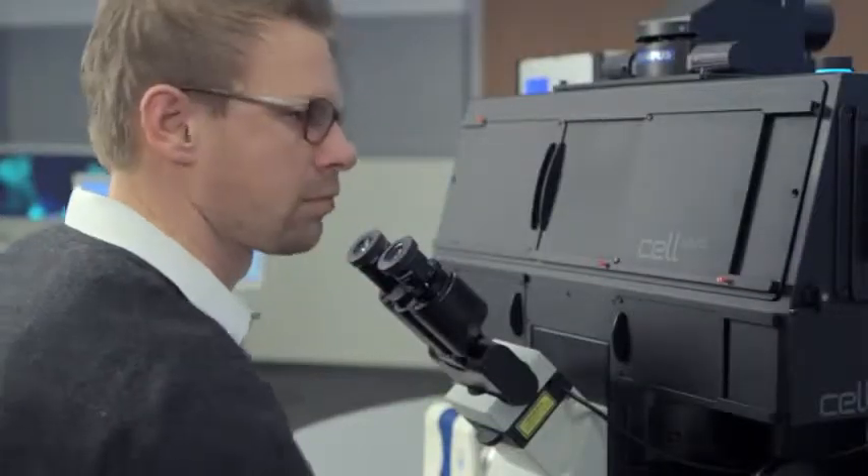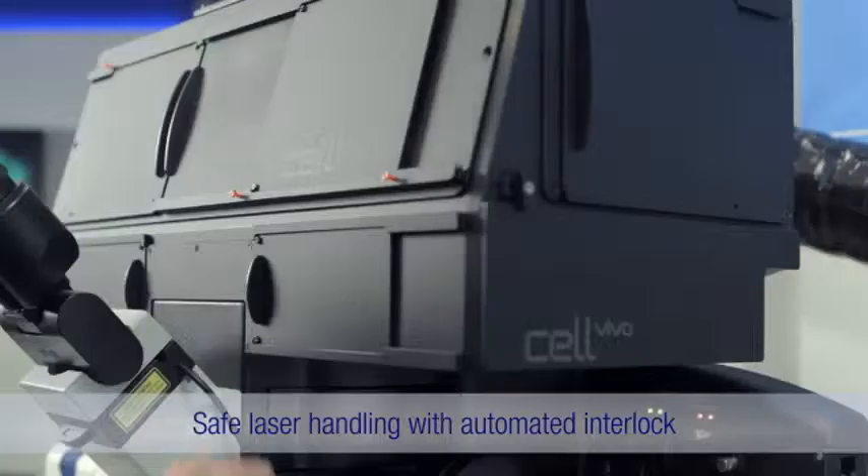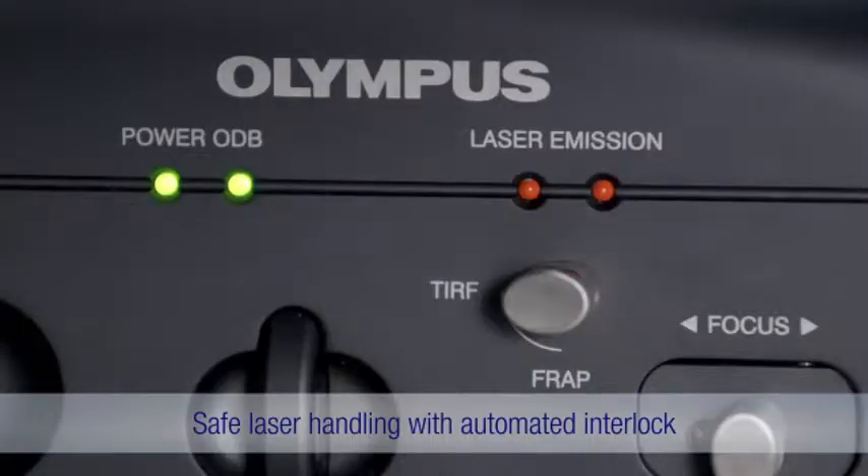When using laser applications such as TIRF microscopy, the integrated safety laser lock also ensures safe handling.